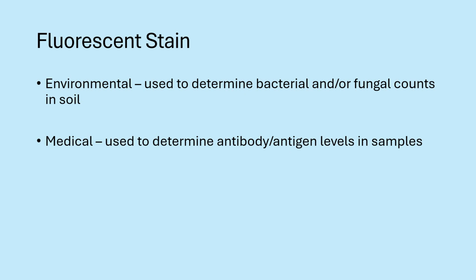Now this was a long time ago. This would have been around 1990. And she had her microscope set up to her computer monitor, so she had a bigger screen for viewing. And she had everything calculated as to what field of view she looked at. She would add the fluorescent dye to her sample, put it under the microscope, and then she'd look at her monitor, and within a certain area, she could count how many glowing spots she saw, essentially.